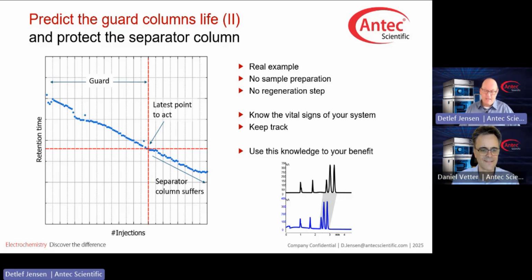Oh, that's a very good question. Why is that question so good? It is true that if you have a carbonate contamination of your eluent, your retention times will decrease. Now, it takes only a couple of minutes until an eluent is contaminated with carbonate. So you will see a sudden decrease of the retention time in your plot. What you also will see is the moment you use freshly prepared eluent, the retention time comes back to what it was before. So it is a sudden decrease and a sudden increase to what it was before.